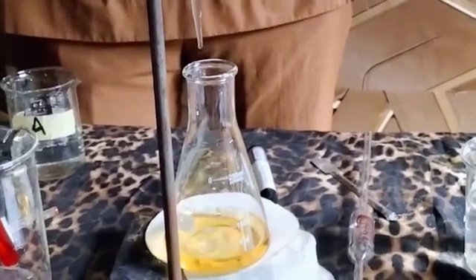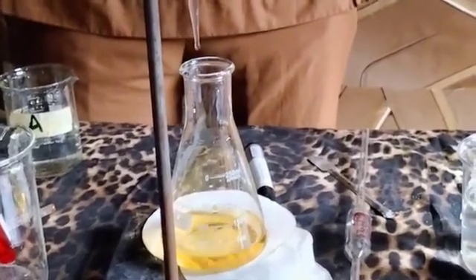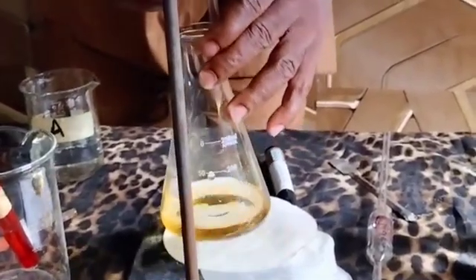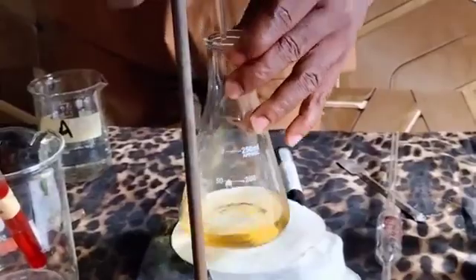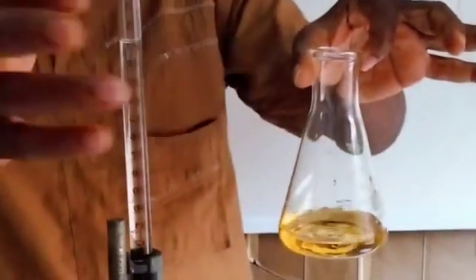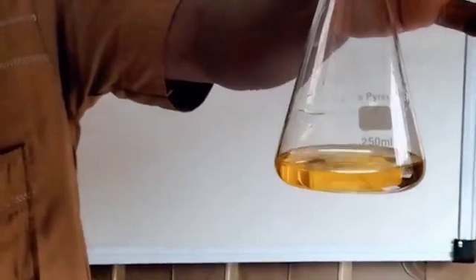So you are moving closer, the color is changing somehow, getting somehow darker, moving closer. So we'll stop it and check. The color had changed. So you can see we have an orange color here. So the color change, if I read it, is at 25.6. So you see this is different from yellow, orange, glittering in appearance, orange color.